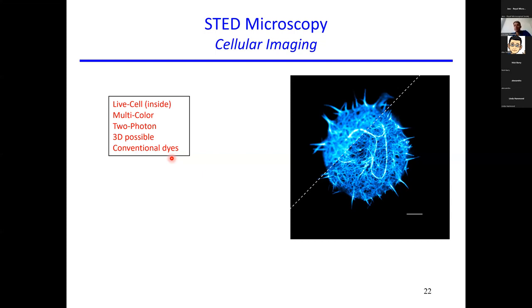And that's why, often, especially with STED, that's the good thing about STED, because you get a direct image. That's what I like about STED. If your sample is bad, your labeling is bad or something like this, you get a crappy image immediately. That's why in confocal microscopy, maybe the spatial resolution was forgiving enough to still see a badly labeled sample well enough.